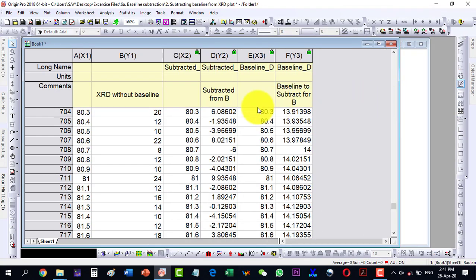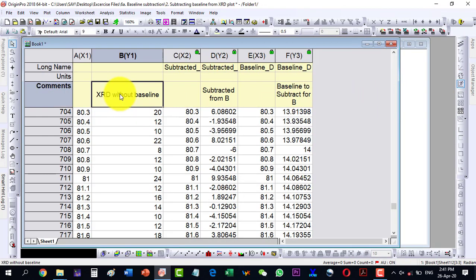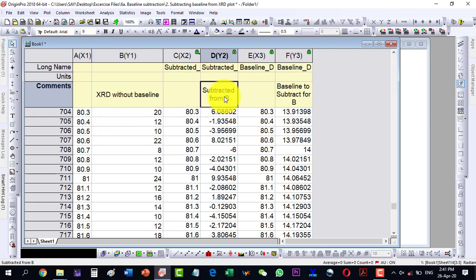It has generated the columns. Now we have the XRD data without baseline, and here we have the XRD with baseline correction. I will label this one 'with baseline'.